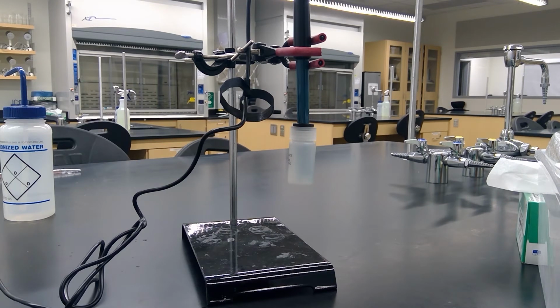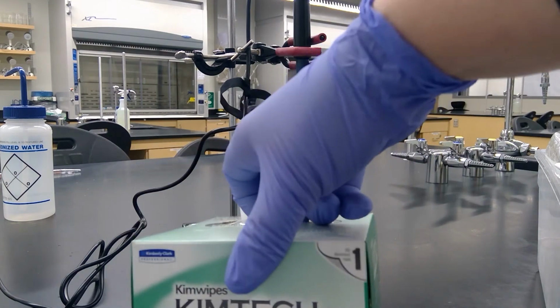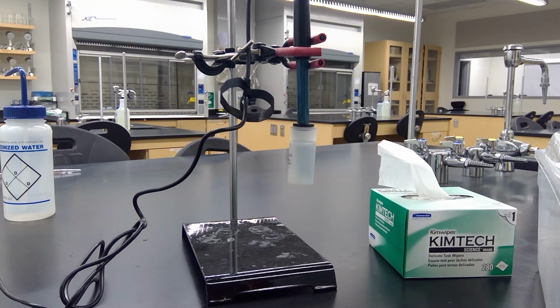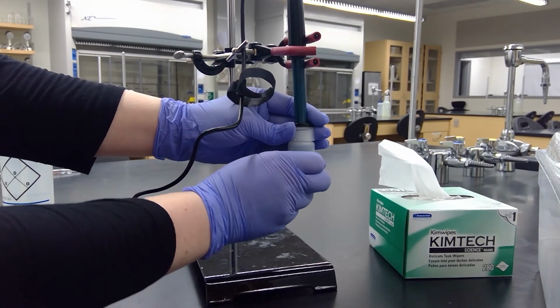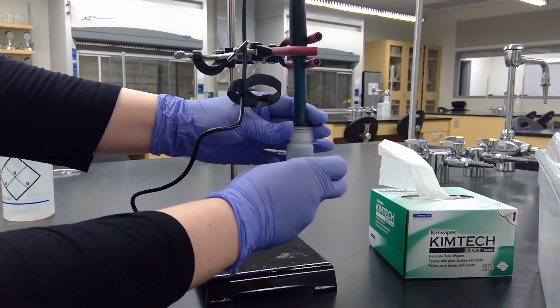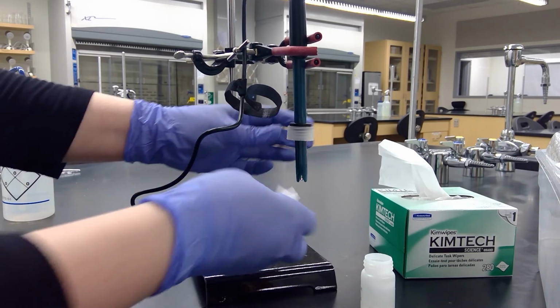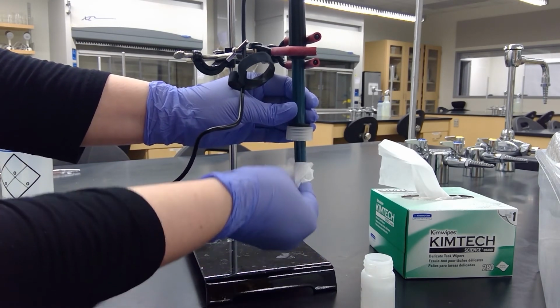And then it says to go through all the steps in step 6 to calibrate the pH meter. You'll want to gently blot the end of the pH meter with a chem wipe to remove any storage buffer. So these are chem wipes. They're just tissues. So we'll take it out of its storage solution. This is just a screw top. You'll just blot it.